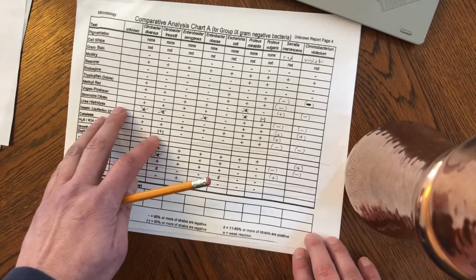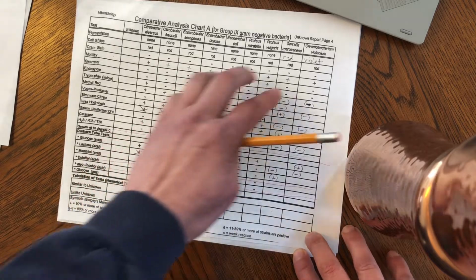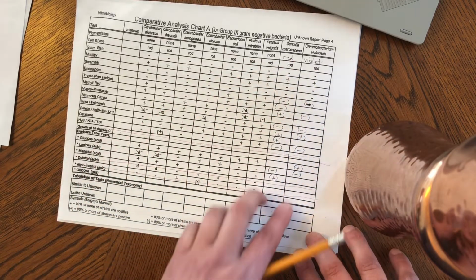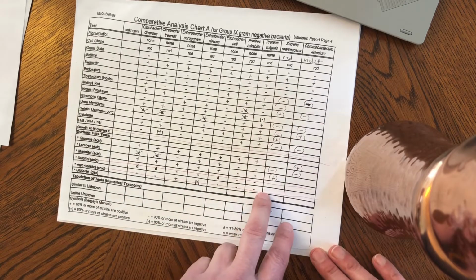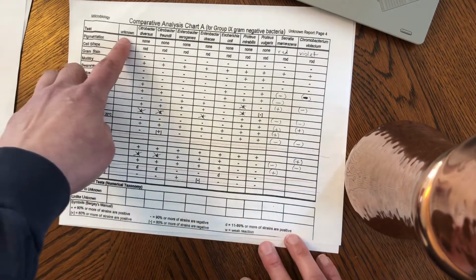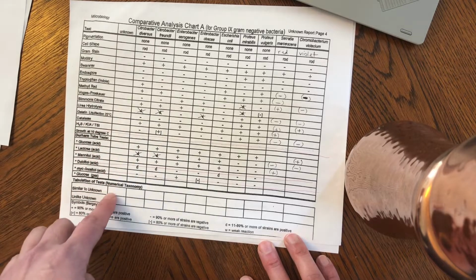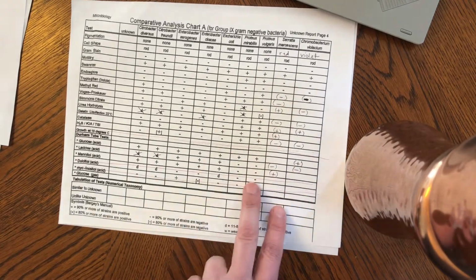So this is a chart that I usually give to all of you that ended up in group 9, and you end up having to fill these 2 lines on your own. You have to go to Bergey's manual, which is the manual that you look all this stuff up from, and get these test results and then compare all of these tests with your unknown. This is where you would write your unknown test results right here. But because we couldn't use Bergey's, given that we are online, I gave you these test results.